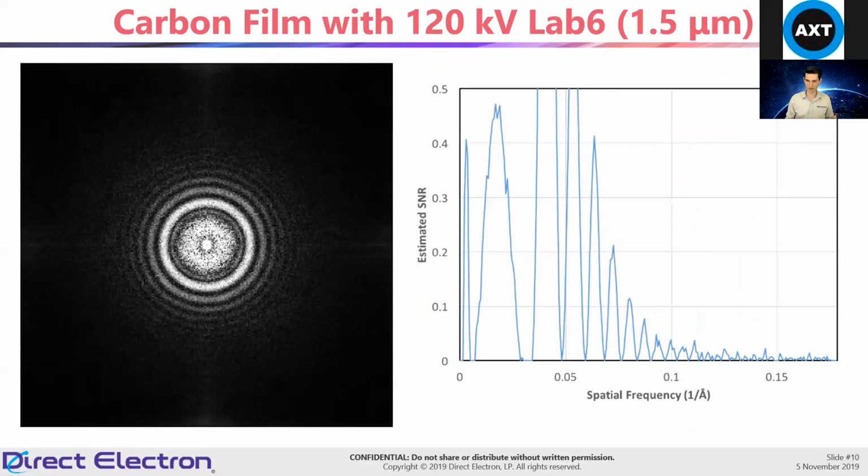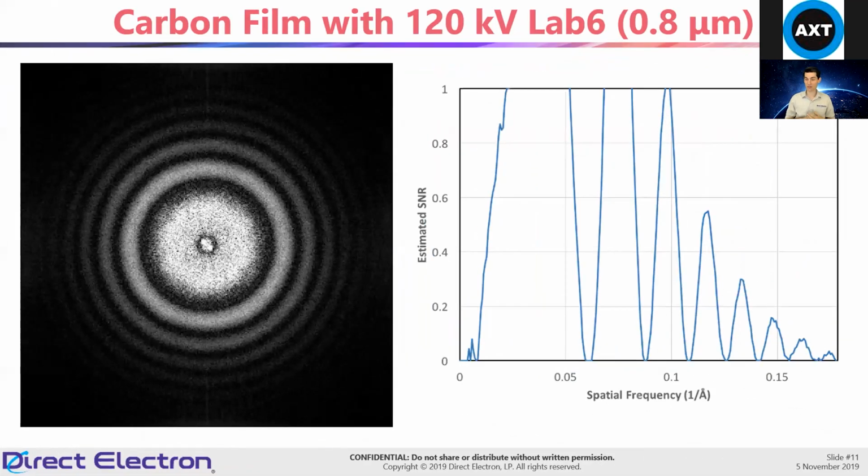But if you use motion correction, then you can get quite a lot of information out of it. And this is especially so if you're using even closer to focus imaging, which you'd have to do with a Lab 6 instrument. And you get quite nice signal to noise out of the DirectView. And this is one of the major benefits.